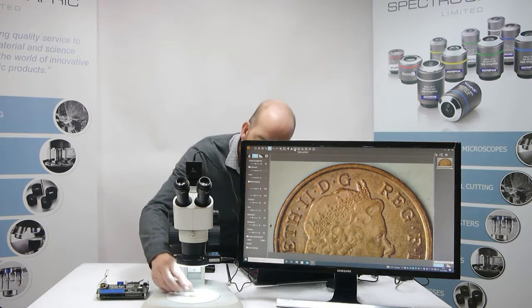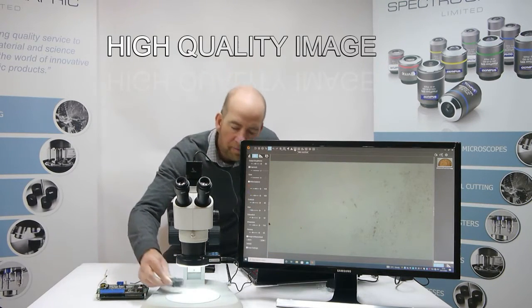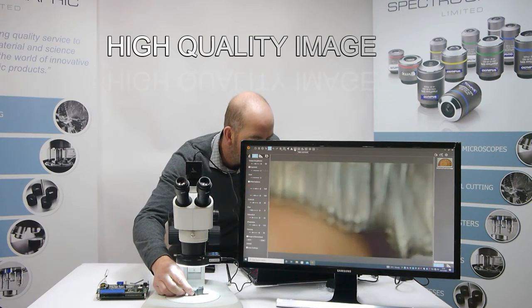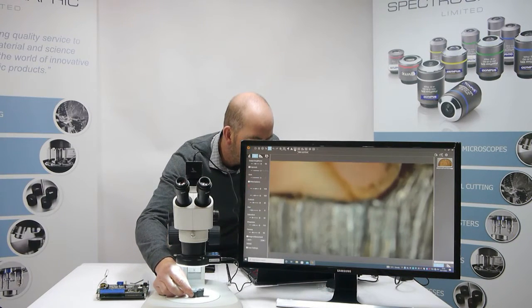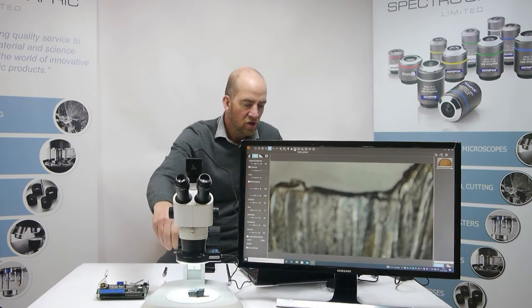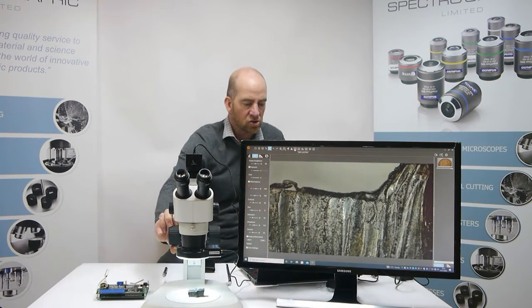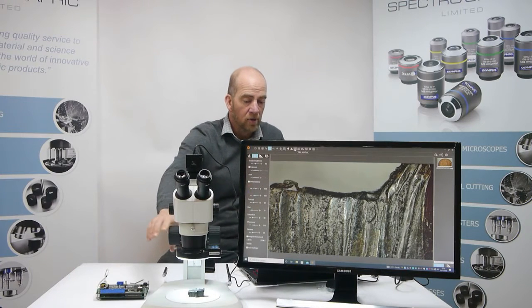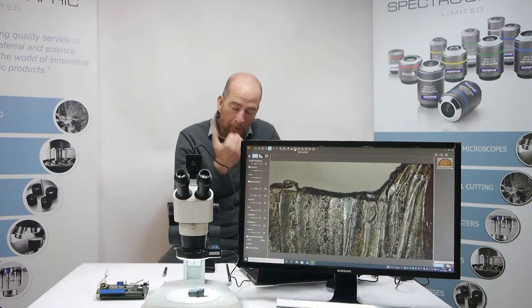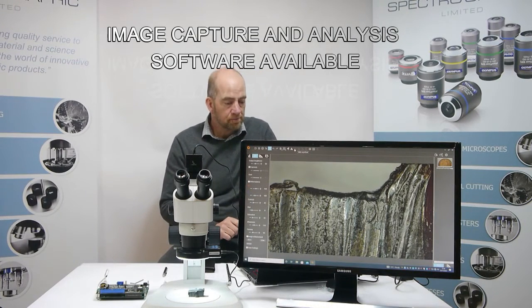So let's have a look at some other images that might be of interest. Here we have a plasma cup sample. It's got a nice, interesting edge. So this might be what we'd use in failure investigation or some research. We can see a nice image on there. I'll capture that image. There we have it.